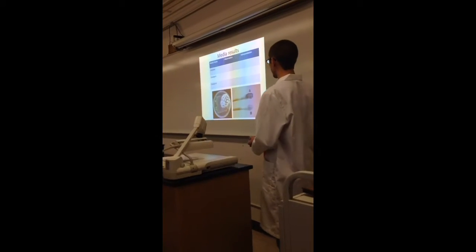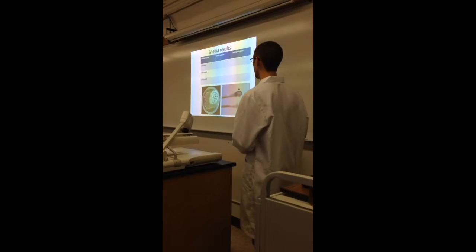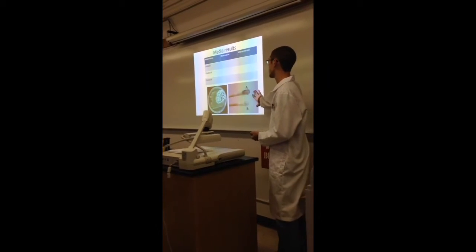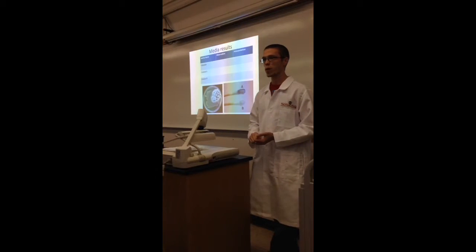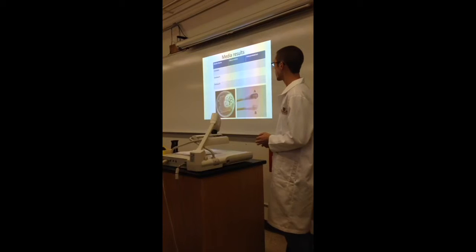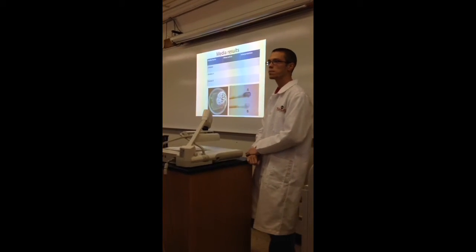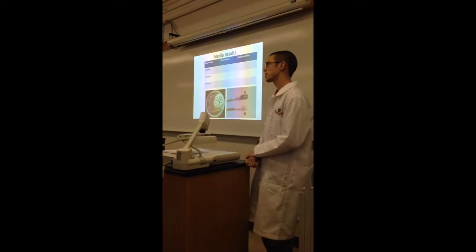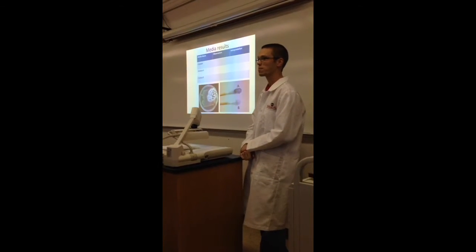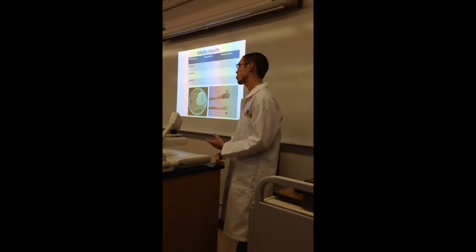This is fairly similar to what you saw in the midterm practical, and you'll be seeing a few of these on the final practical as well. This is just looking at the media results. You have a catalase and 2 oxidase tests, and you're going to be required to make the observations and the interpretations for all 3 of these. Does anybody have an observation and the following interpretation for any of these media? Or to start off, which one's catalase and which one's oxidase? It's the easiest question. Bubbles, catalase. So what would your observation for catalase be? Bubbles. No bubbles. Okay, good.